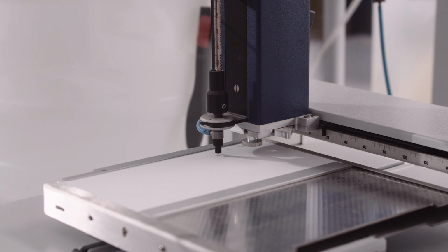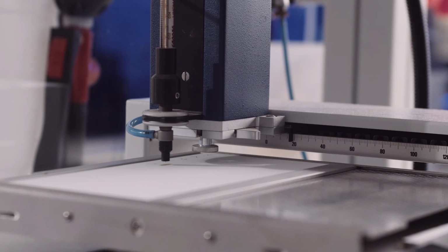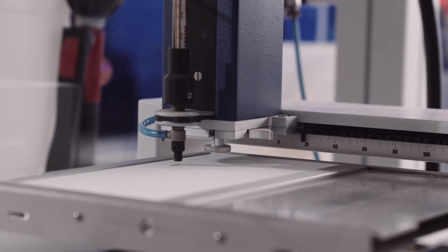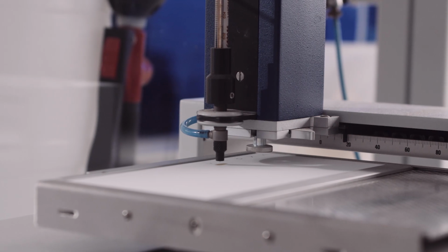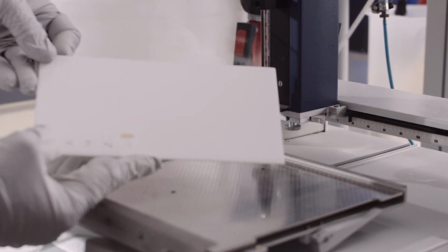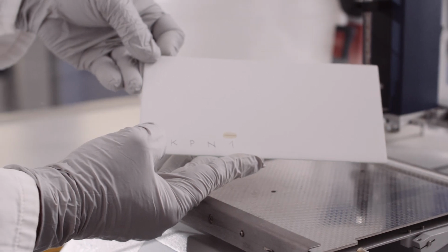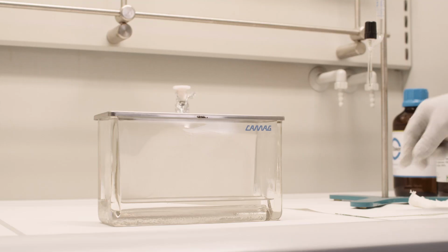The mobile phase, which is typically a mixture of organic solvents, travels through the chromatographic plate by capillary action, separating the compounds in the sample based on differences in adsorption to the stationary phase and solubility in the mobile phase. The sample solution is applied to the chromatographic plate manually with glass capillaries, while special automatic applicators are also available for quantitative work. Deposits are spots in manual application or line deposits in automatic application.